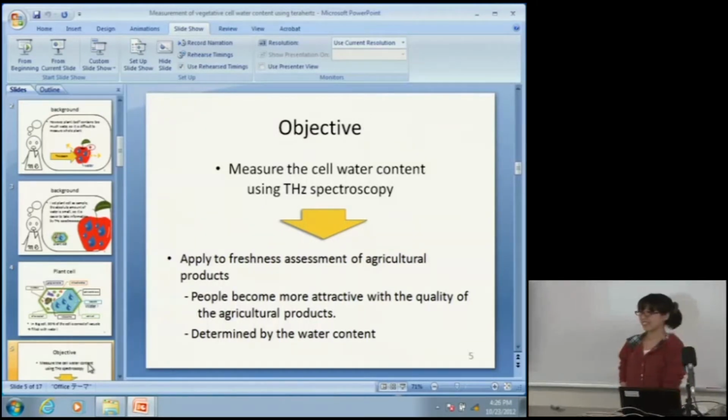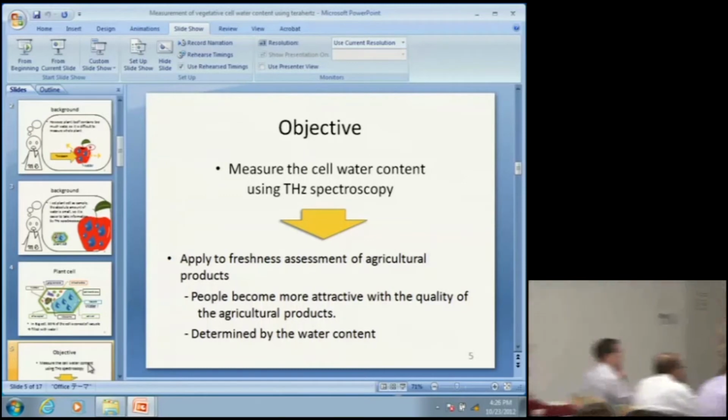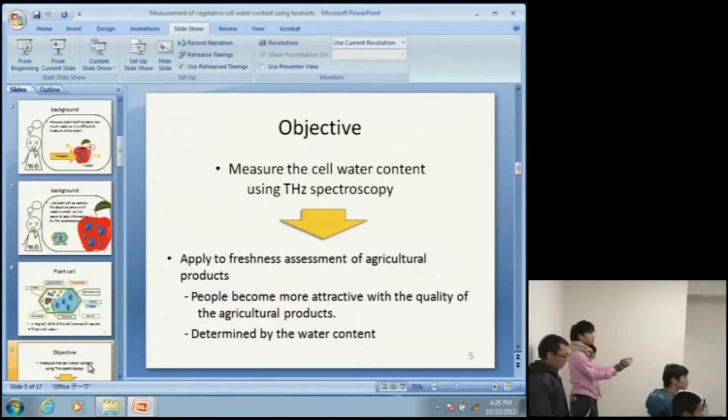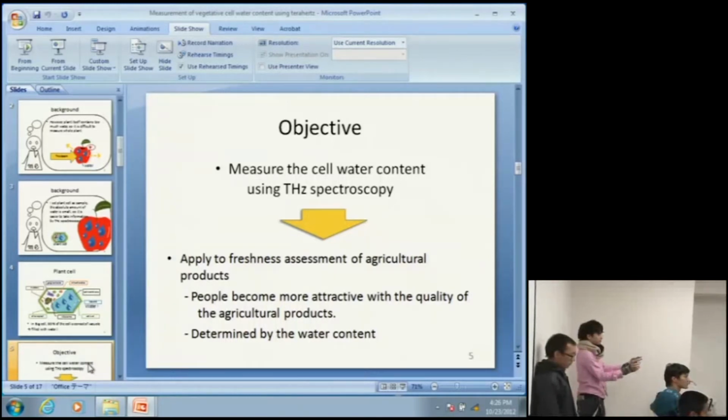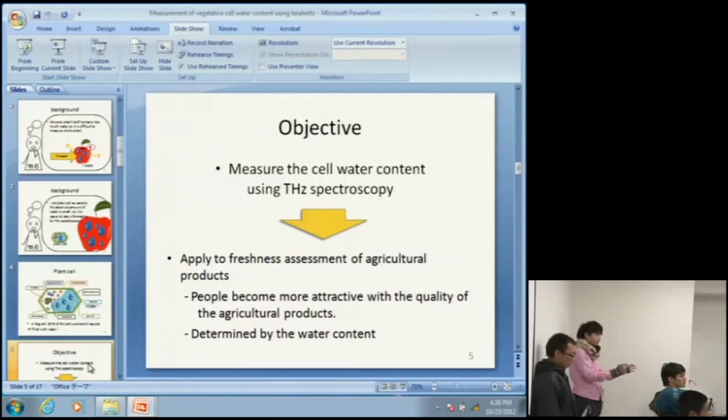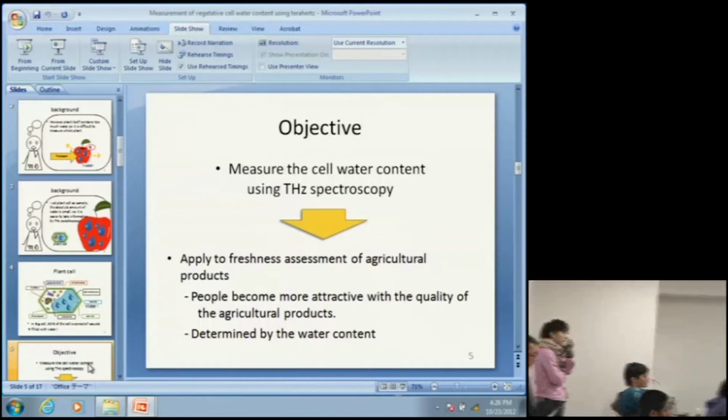Anyone else? I have a question. In your microscopic observation, you use the transparent cover glasses. How about using colored cover glass, for example, black color, or anything like that? So maybe you can easily measure the distance. Okay, thank you.